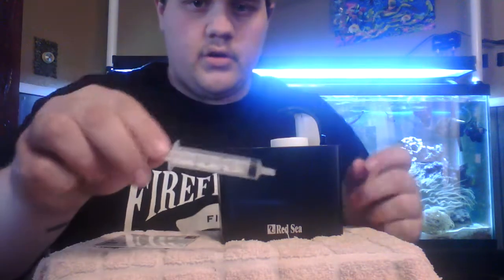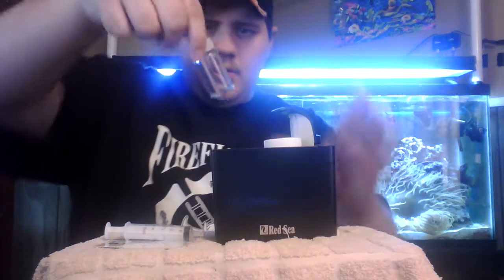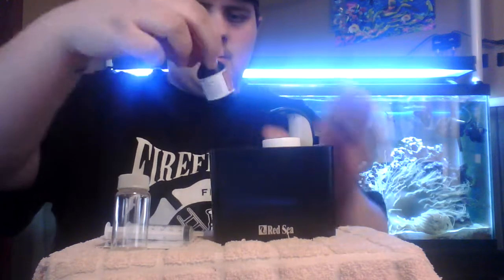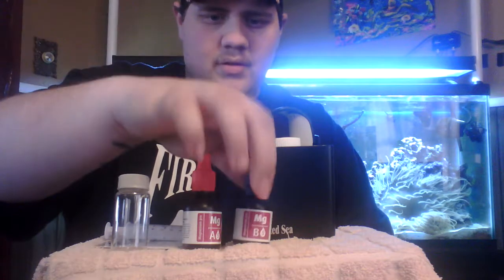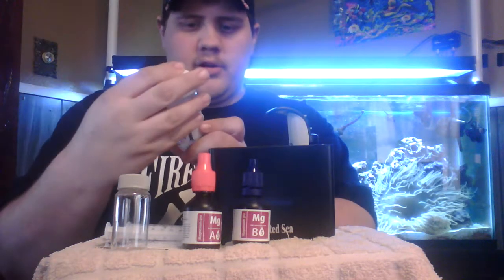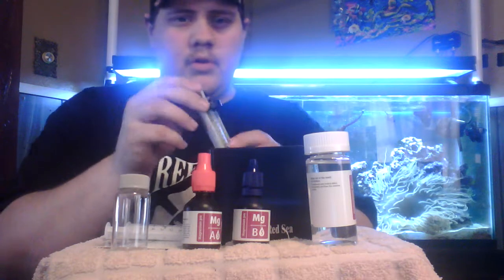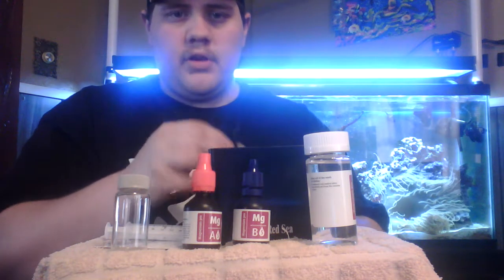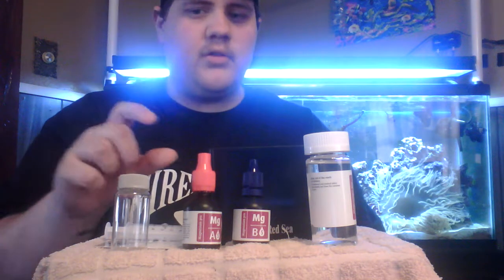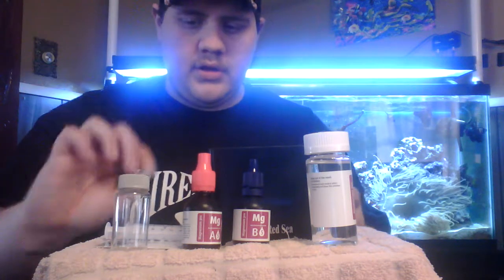We have a five milliliter syringe to get your water from your tank, a nice little testing vial, Reagent A, Reagent B, and this will be your titrator — Reagent C. The Red Sea Pro kits come with these nice titrators, which are so much easier than using a little dropper into a test tube vial and shaking it. So you get your little syringe and your titrator.